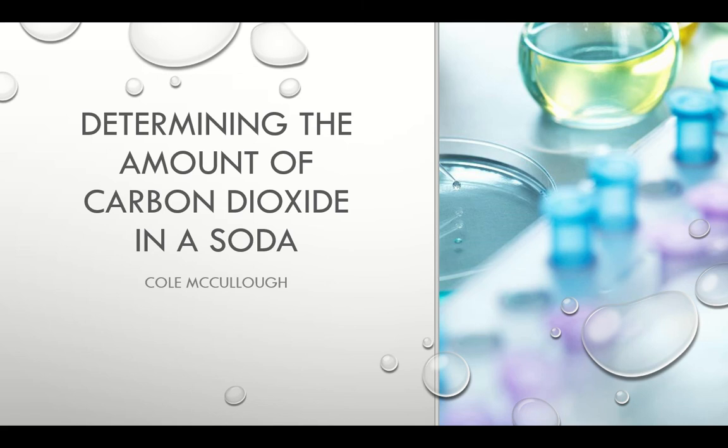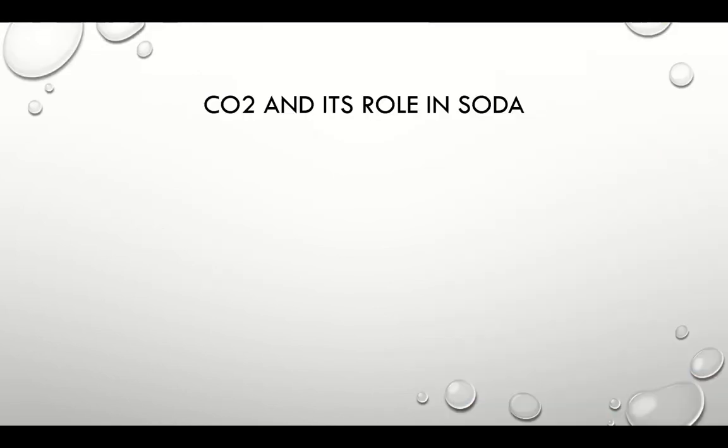Hi, my name is Cole McCullough, and today I'm going to be talking to you about an experiment that I've run of determining the amount of carbon dioxide in a soda.